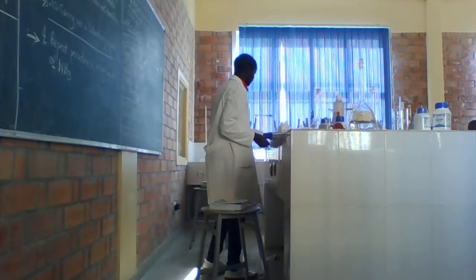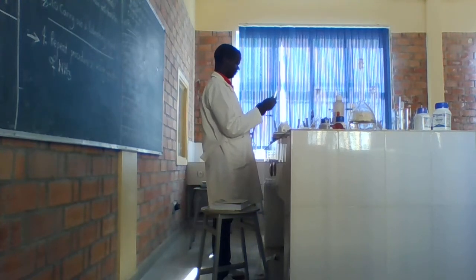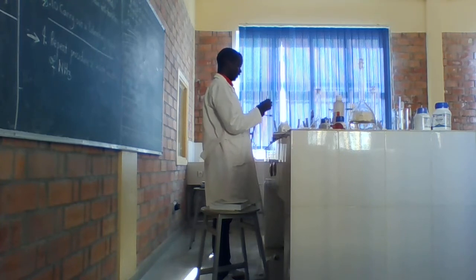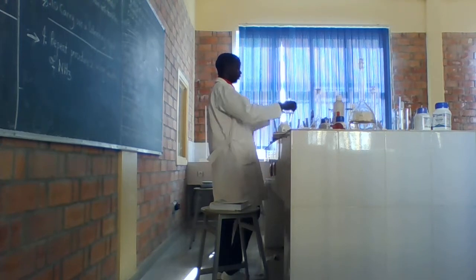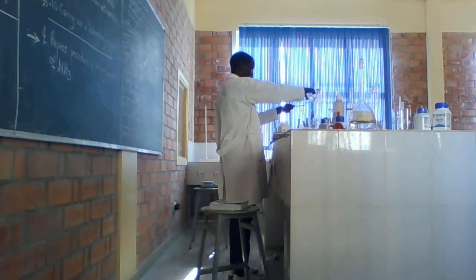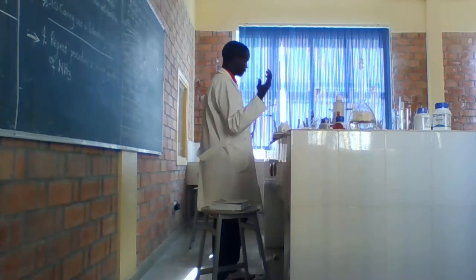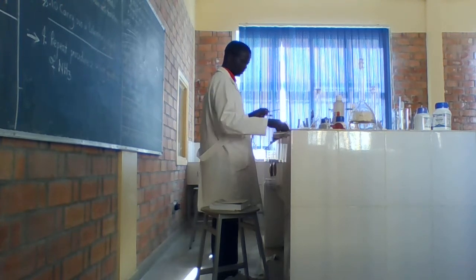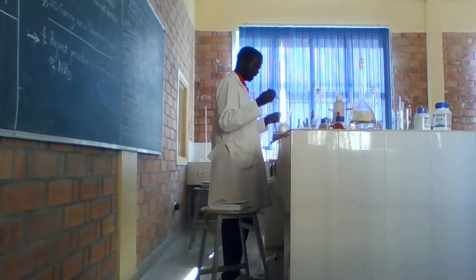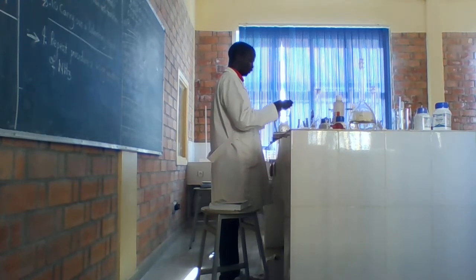Let us take an example. We have a test tube holder, and I hold this test tube using the holder, and I take a quantity of water to put in and fill it. And then secondly, using a spatula, I take a quantity of reagent, a spatula full of it.